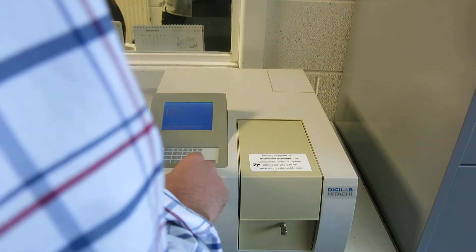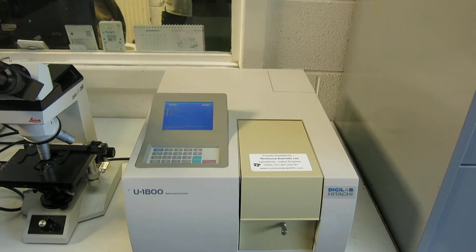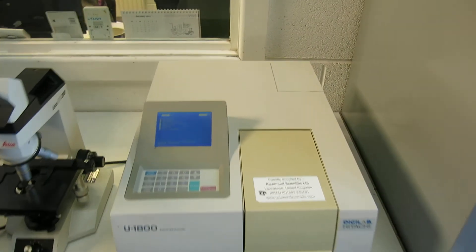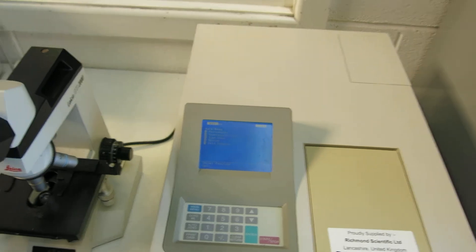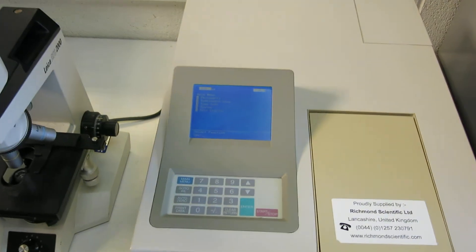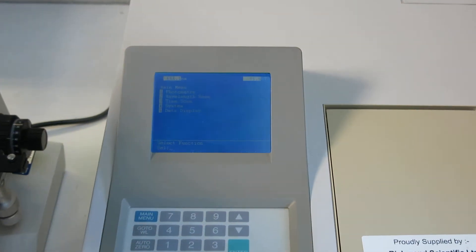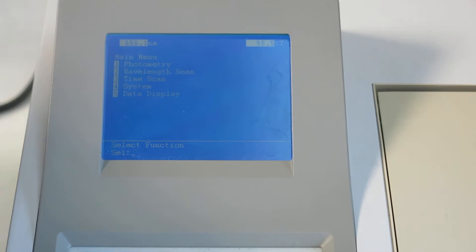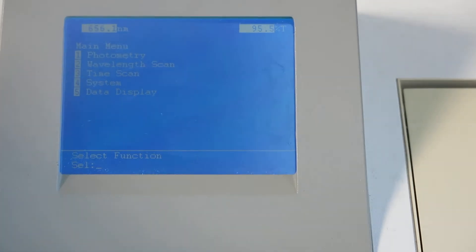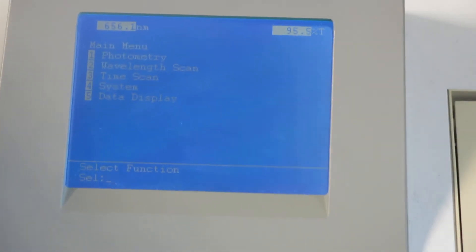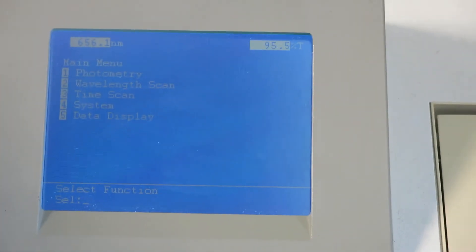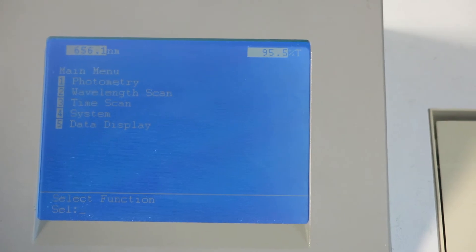We go on to the main menu. So the main menu here is just trying to zoom in on this. We'll hopefully show you the different configurations on the menu. Just zooming in on that now. It might give you some idea of the configs. So we've got main menu, we go down.